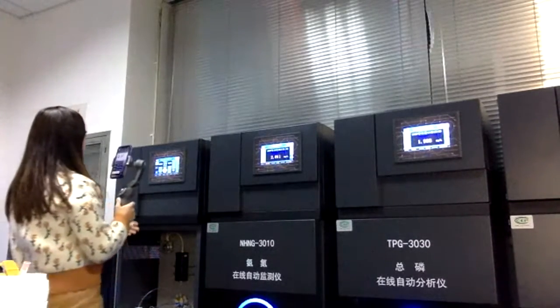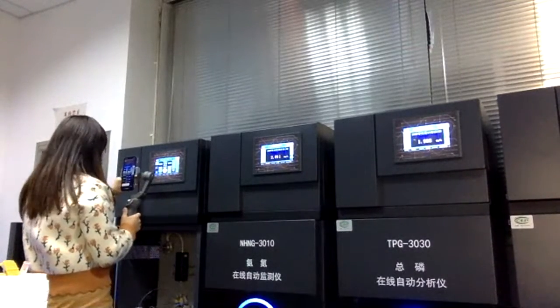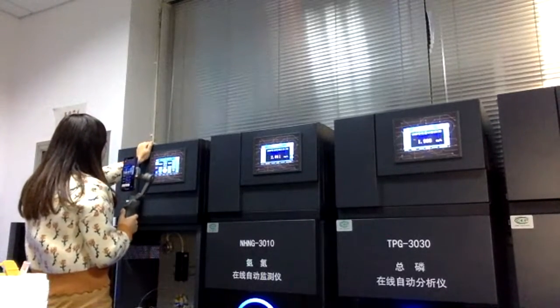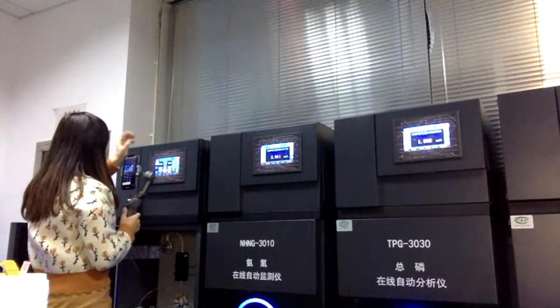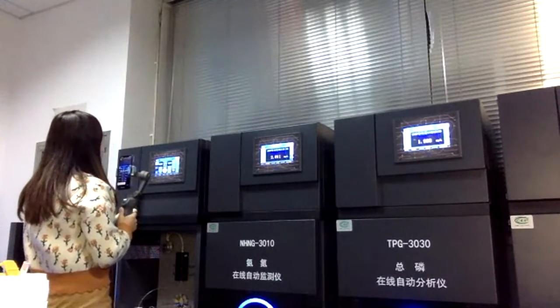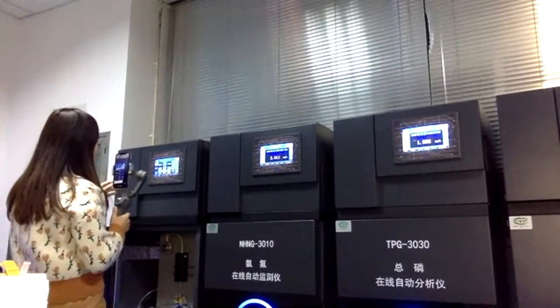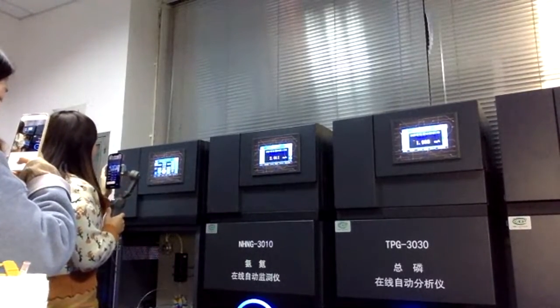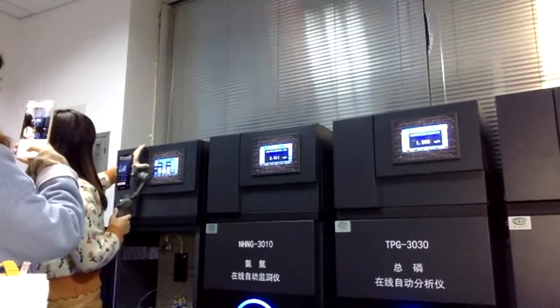So this is for hand operation, using the different valves. This whole page is in charge of the different valves and the reagents, showing how you can operate to add reagents or change them. It also includes how to discharge the water. So the whole page is showing the hardware functions and how to operate them. All of them are shown on this page.